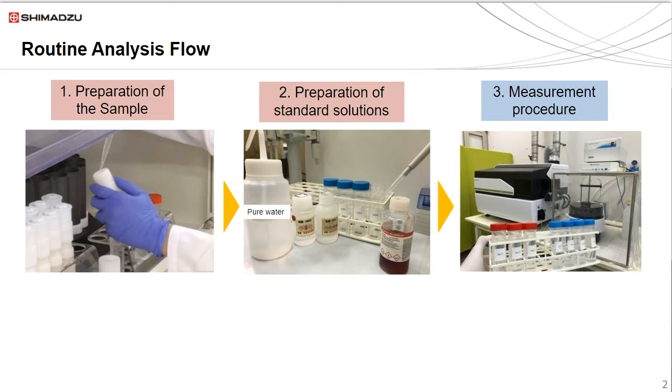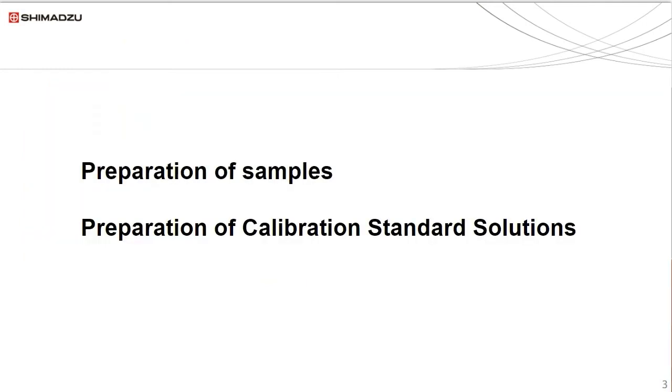Also critical are maintaining the sample introduction hardware and ICP-MS instrument, checking for signal drift, and ensuring proper performance of the instrument. First, I will go into some detail about sample preparation and preparation of calibration standards.